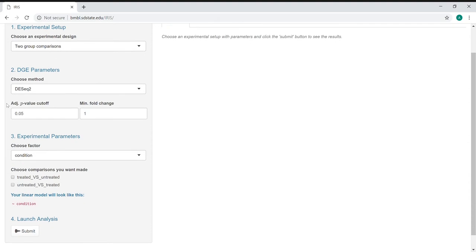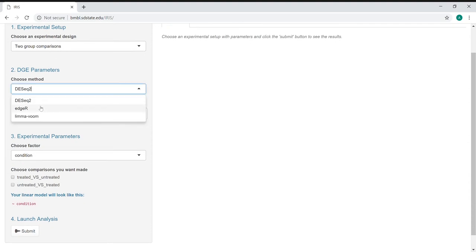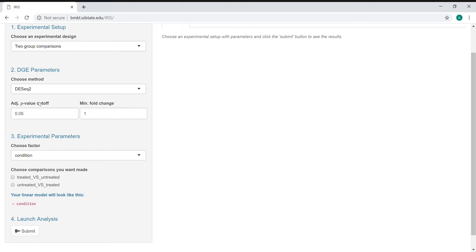So we'll go with the two group comparisons here. We have three built-in tools here, three of the most commonly used R-based differential gene expression analysis tools. DESeq2 is the default tool. Also EdgeR and LIMAVoom are quite popular.